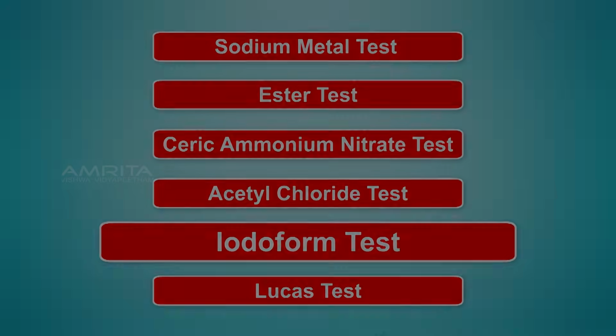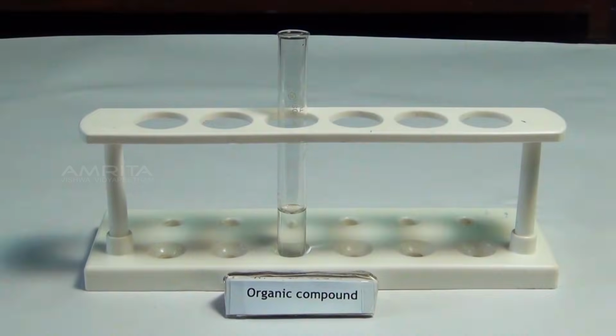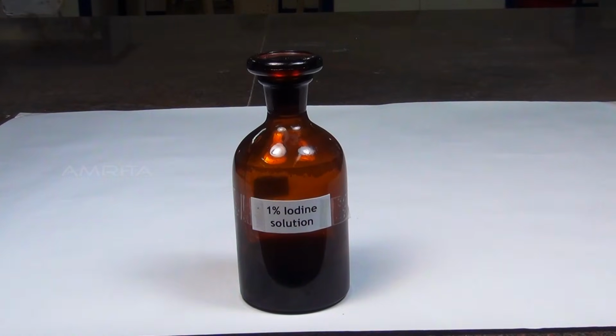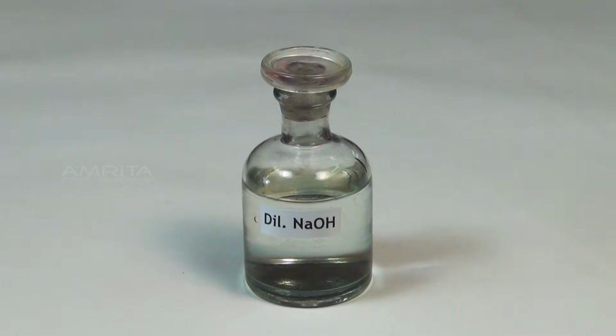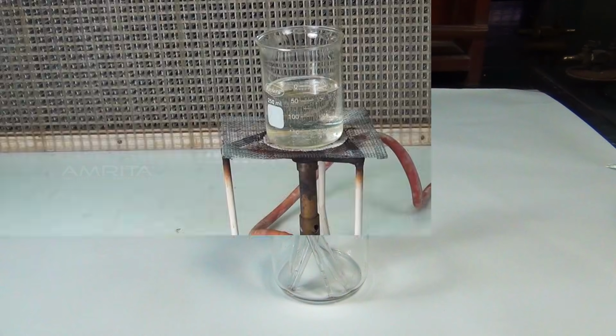Iodoform test. Materials required: organic compound, 1% iodine solution, dilute sodium hydroxide, test tube, droppers, and water bath.